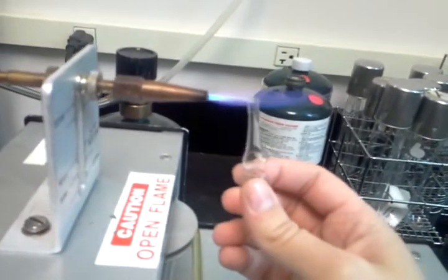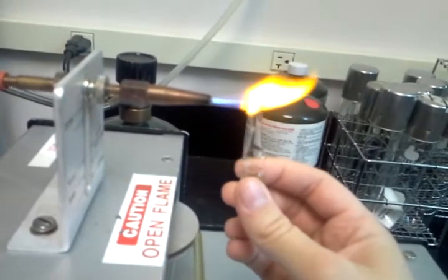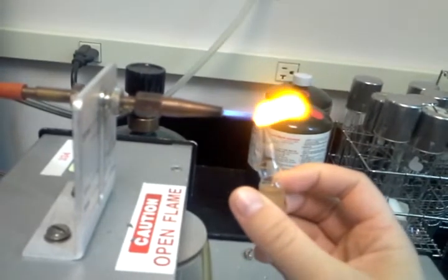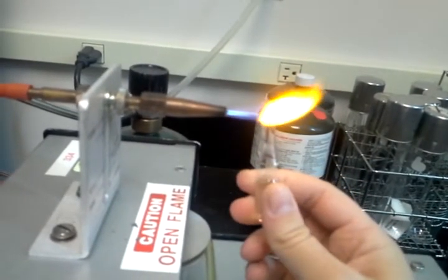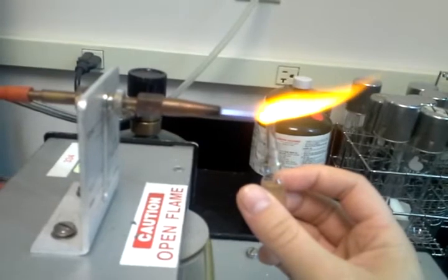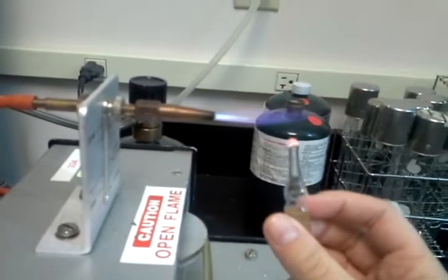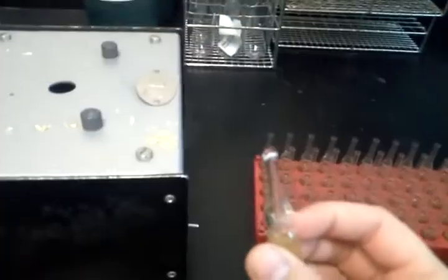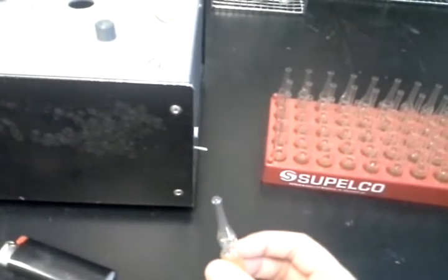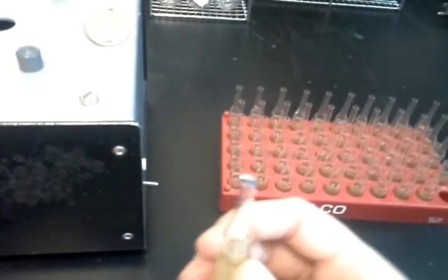So here we go. Alright, nice and sealed at the top. It doesn't want to focus, but it looks like a nice good seal. I'll have to test it later to make sure.